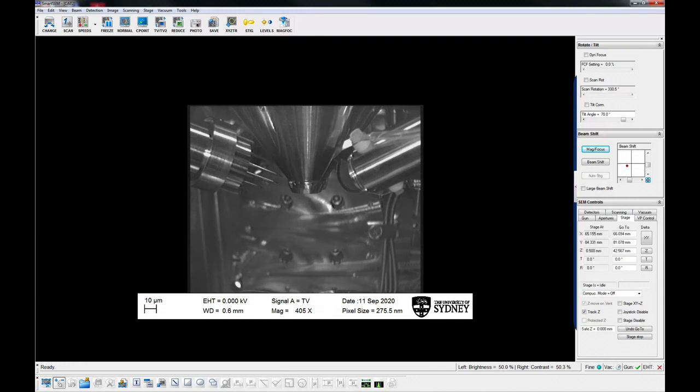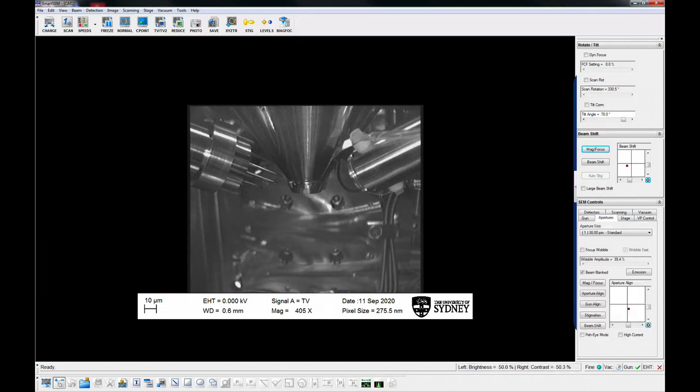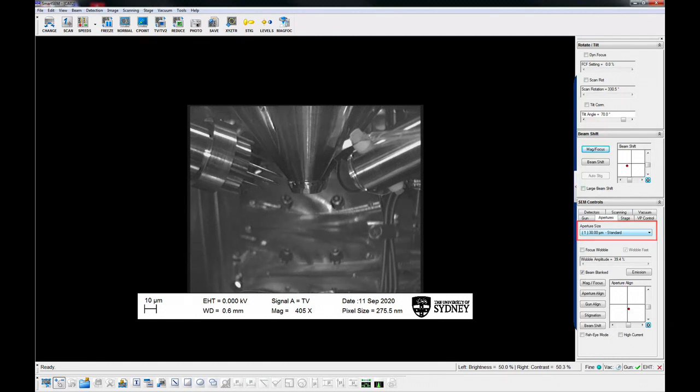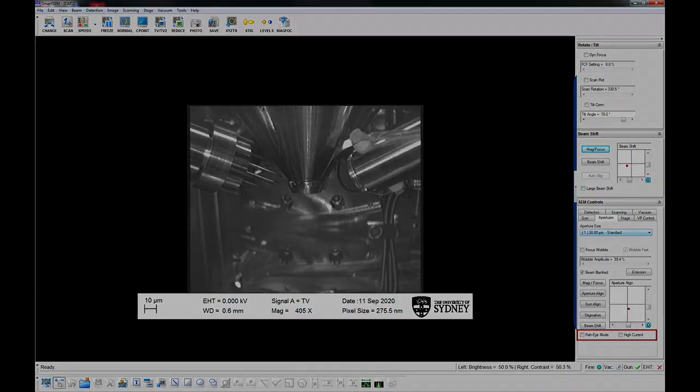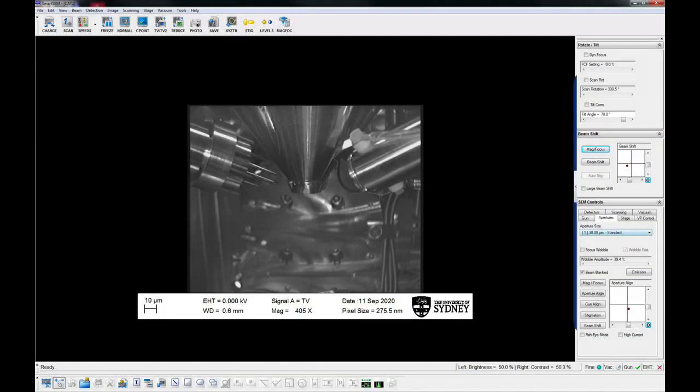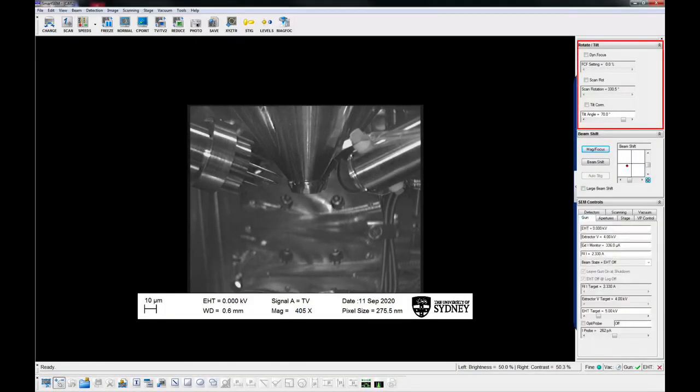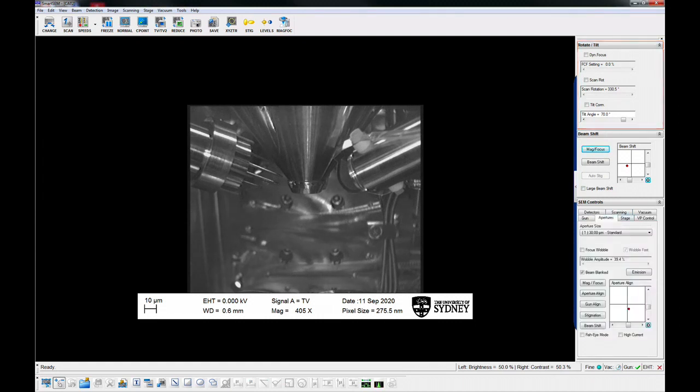While it is pumping, check the SEM control panel and make sure aperture is set to 30 microns. High current mode is off. Fish eye mode is off. Tilt correction, dynamic focus and scan rotation is off.